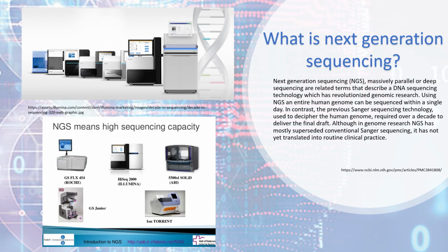So with all of that background information, we can still ask, what is next-generation sequencing? Well, it's a massively parallel or deep sequencing related term that describes a DNA sequence technology that has revolutionized genomic research. Using NGS, an entire human genome can be sequenced within a single day.